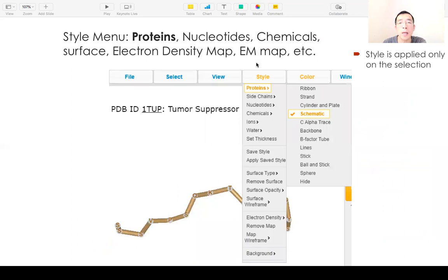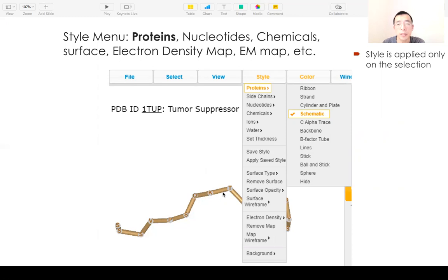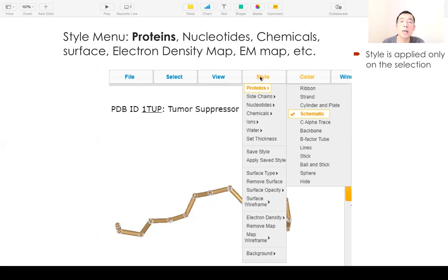In the style menu, you need to select whether it's a protein, side chain, nucleotides, chemicals, ions, or waters. Then select the style. By default it's a ribbon. You can change to a schematic, show sticks, or show C-alpha chains. You can also show the molecule surface, electron density map, or EM map. Since the menu is colored orange, all your actions will only apply to your current selection.